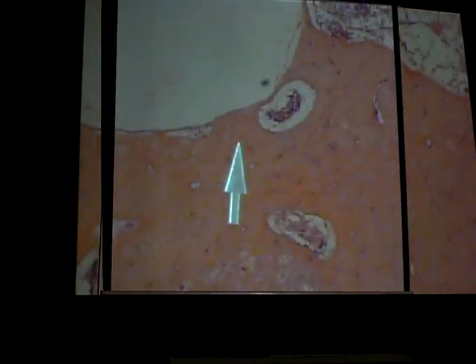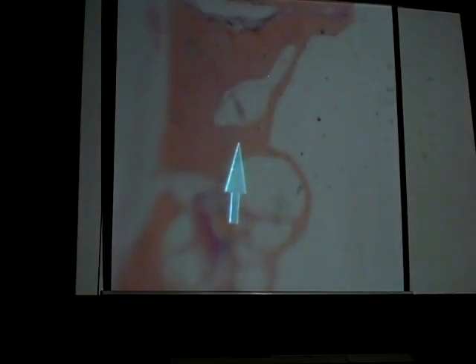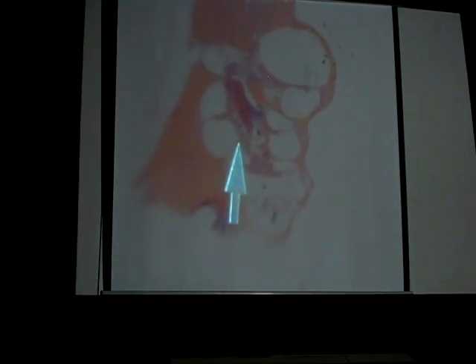Let me show it to you at scanning view first, and then we go back to low power. All right, so remember, this is scanning view. We have our cochlea here. This one is flipped the other way. Our cochlea is usually above this, or if the slide is oriented the other way, sitting below it, that's where you would find your cristae ampullaris. Or over in this section, that's where we find our macula.